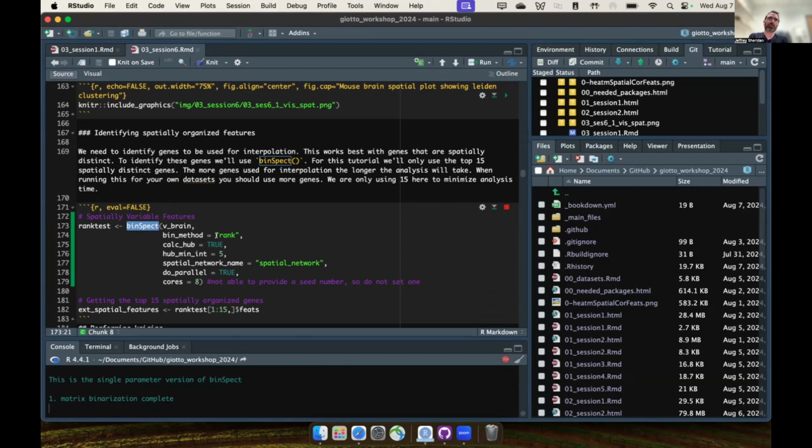perform feature interpolation on any gene that you want. But if we take, say, a gene that's expressed in every single cell, it's just going to be attributed to every single nuclei within the tissue. So we're not getting any further information out of it.